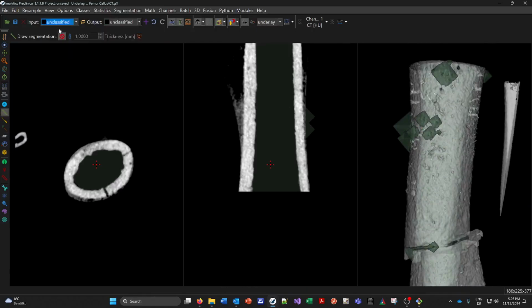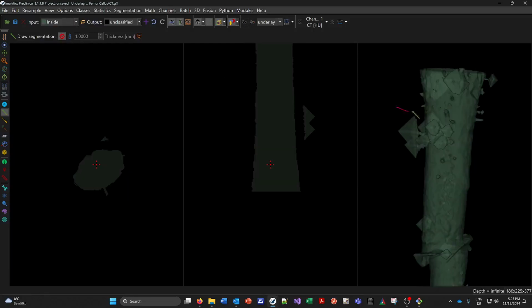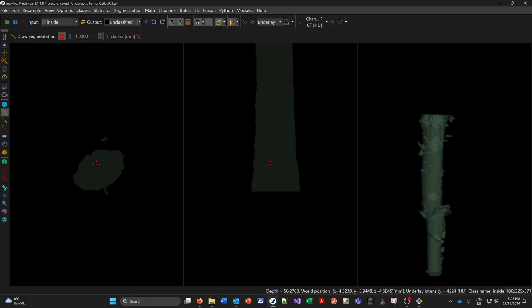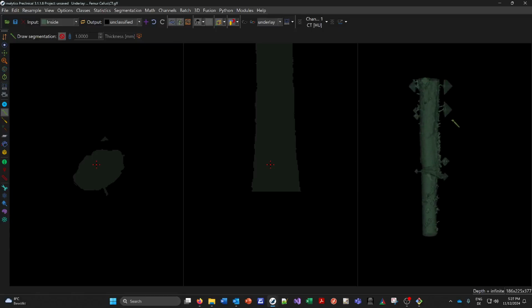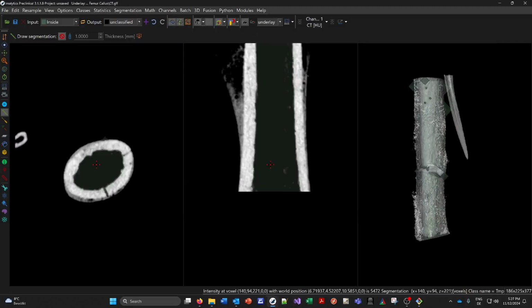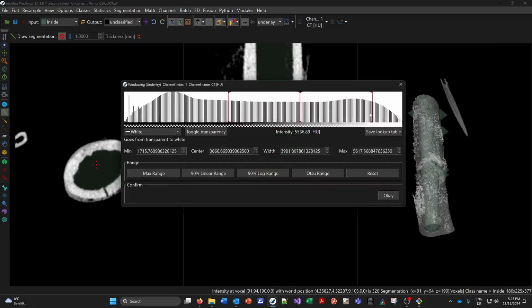look, you don't want here. So you could just do it like this and cut them off. This is another approach which is sometimes helpful if you have holes and the fill region tool is somewhat compromised by them. Okay, so this is a trick to segment the bone, the cortical bone, and the inside. But what about the callus?